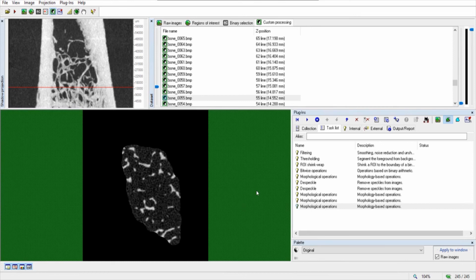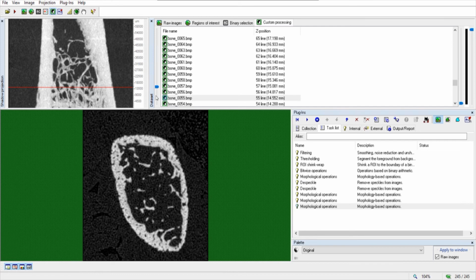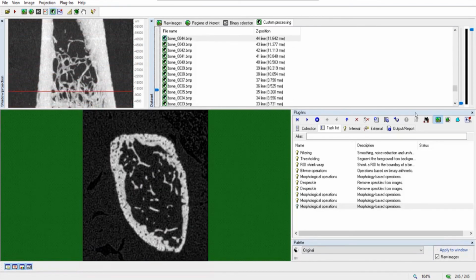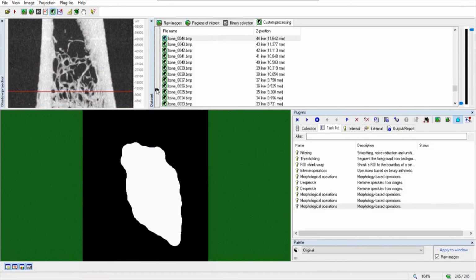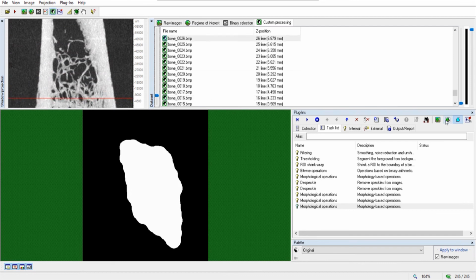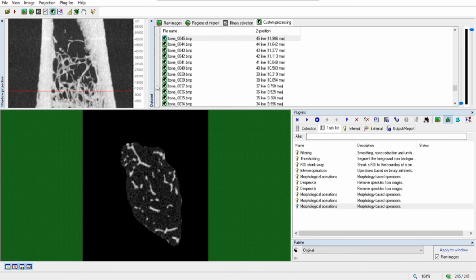Hello! In this video I'm going to show you how to create a nice 3D video for your presentation. In a previous video I showed you how to create a task list to separate the trabecular region from the cortical region. This is the total bone, the original data set, and this is the selection of only the region of interest containing only trabecular bone, and this is the result we got.